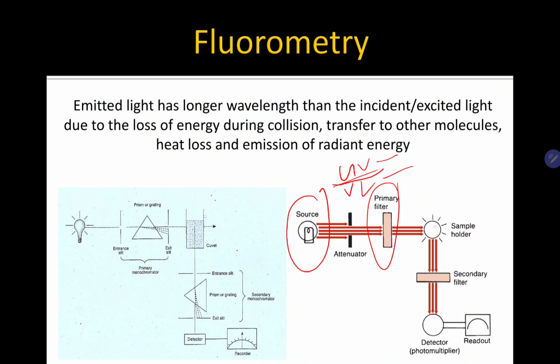Okay, so after that, the sample holder holds the sample, the electrons present, the molecules that you are testing or the analyte you're testing, which will now undergo yung process kanina, the fluorescence.